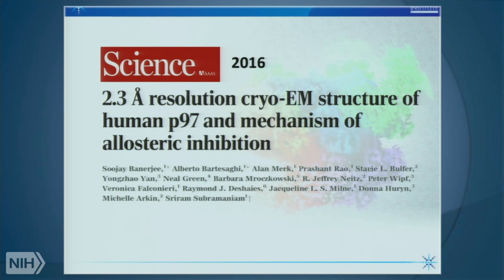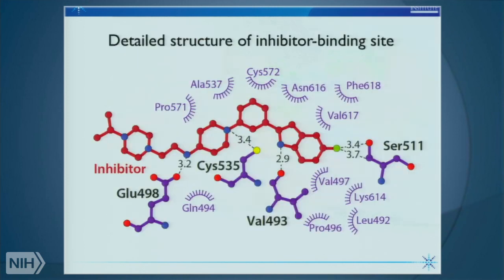But Sujay's work led to the structural biology of P97 in the ATP-bound form. More importantly, at that time it was the first example where we could resolve a small molecule bound at near atomic resolution. This was published in Science in 2016.